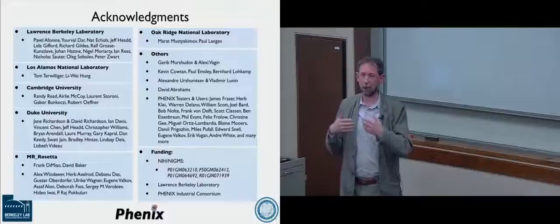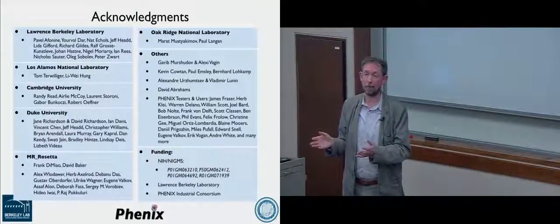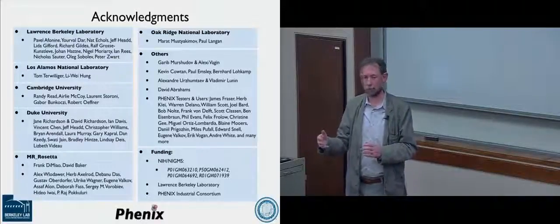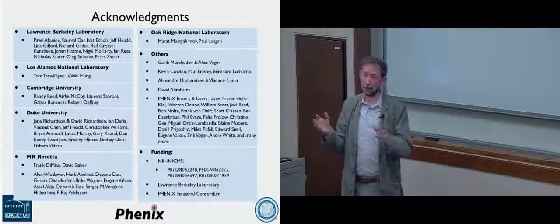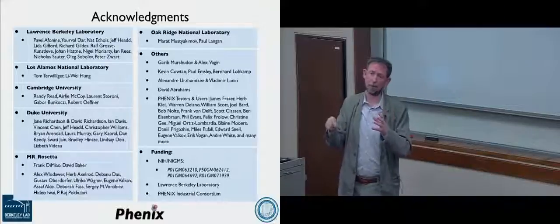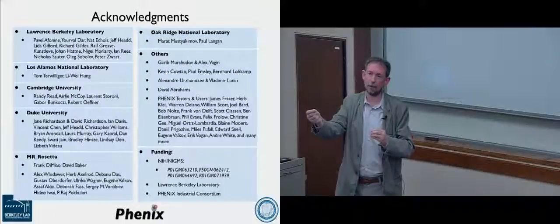So there is actually a wealth of possibility for depositing all of that. There will be a push, certainly in the context of Phenix over the next few years, to make that automatic, so that when you solve your structure, you can press the deposit button and we will suck that all up and put it into the Protein Data Bank.